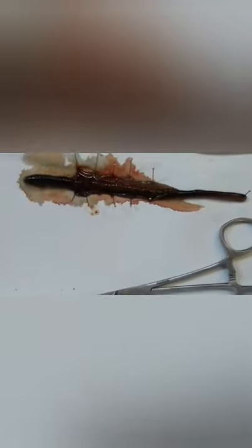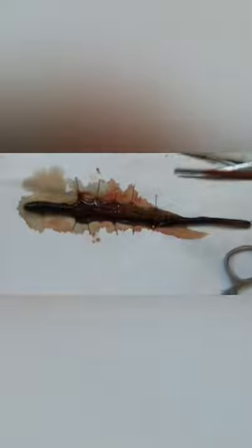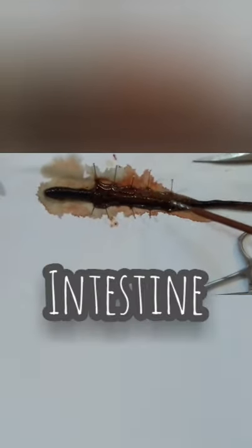A few minutes later. So now we have finished dissecting its posterior aspect, and as you can see, the part here is its long and thin intestine, where it digests the food or the soil and other minerals it eats.